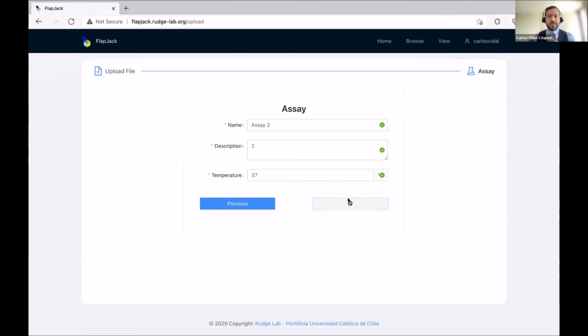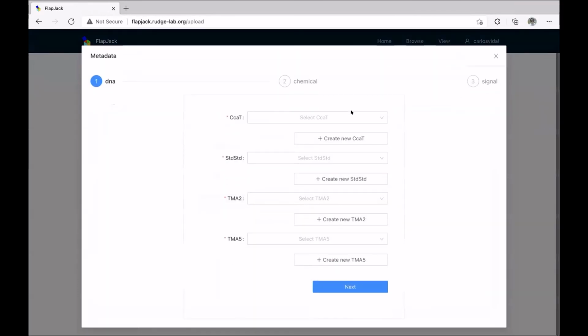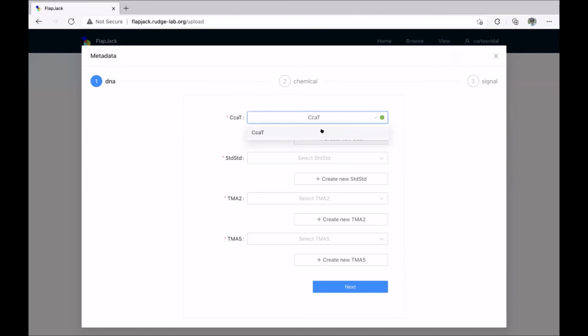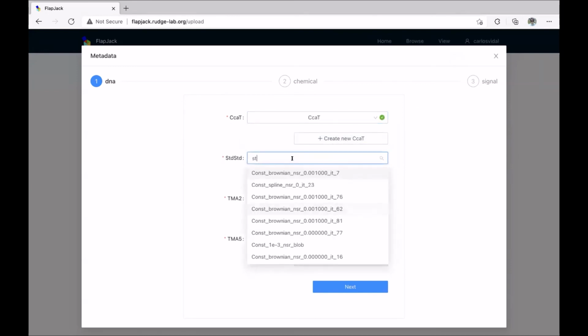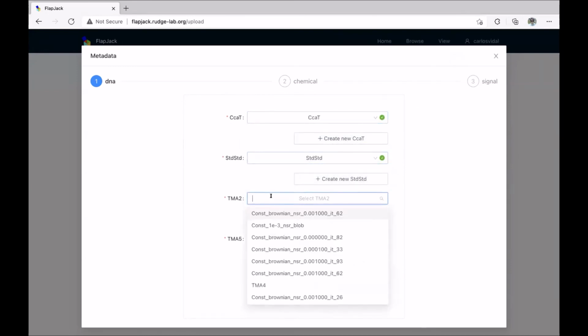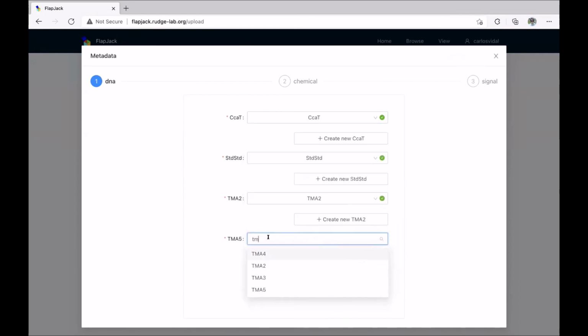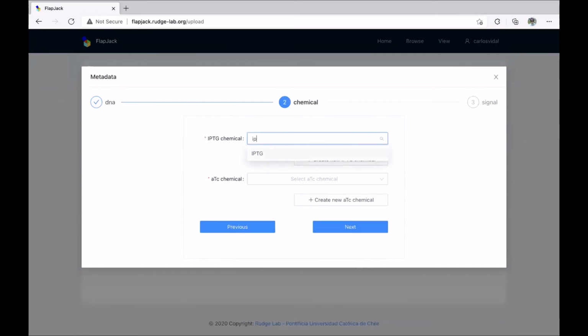So I guess along those lines, you mentioned you can add, let's say, the wavelengths and even the filters, for instance. All of that is possible too? Yeah, it's just an open description text field, essentially. So you can put whatever you like. Oh, I see. So it's not like a customizable key value pair. Is that correct?